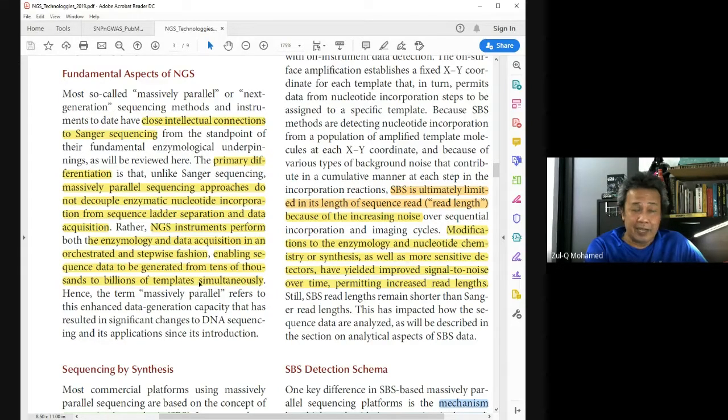This is another keyword: simultaneously. When we did Sanger sequencing, we would use gels, meaning each lane can sequence one fragment. In total, I think about 36, and normally you don't use all lanes, and you need to replicate. So in the end, you can probably only sequence about 10 or 20 different samples at one time.